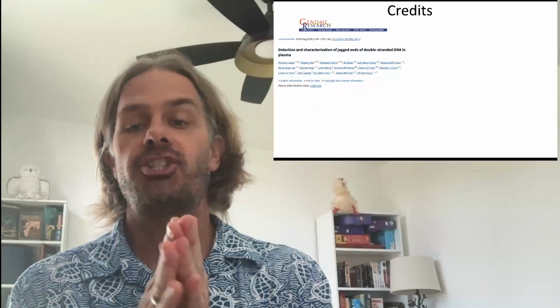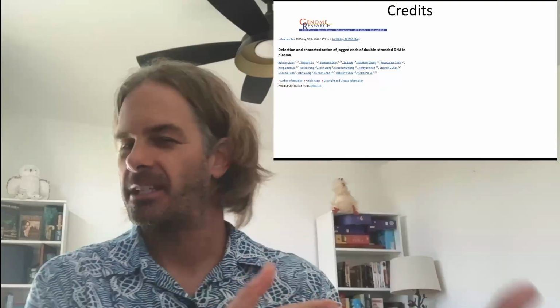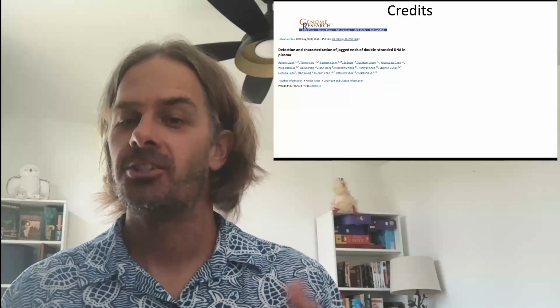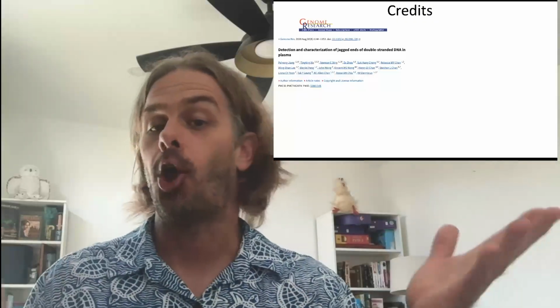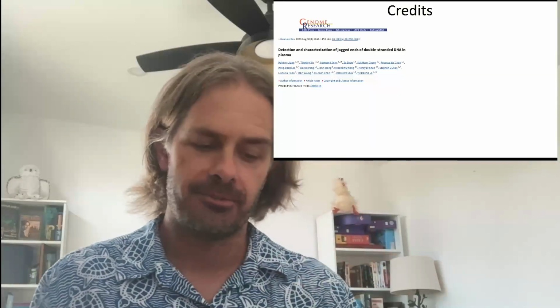But anyways, check out this paper. Very cool. They don't look at tissue of origin here. They use the methylation signature and end repair to examine how long overhangs are in double-stranded DNA. Very awesome stuff. Again, not our initial observation.